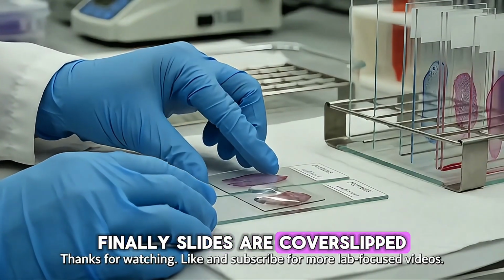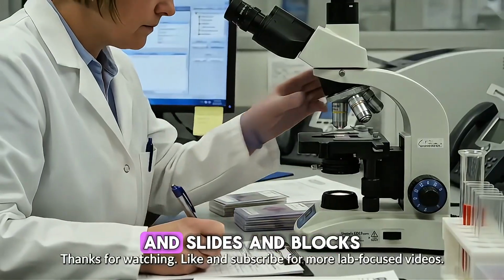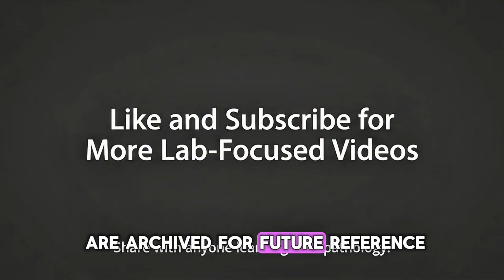Finally, slides are cover-slipped and reviewed by the pathologist. A report is issued, and slides and blocks are archived for future reference.